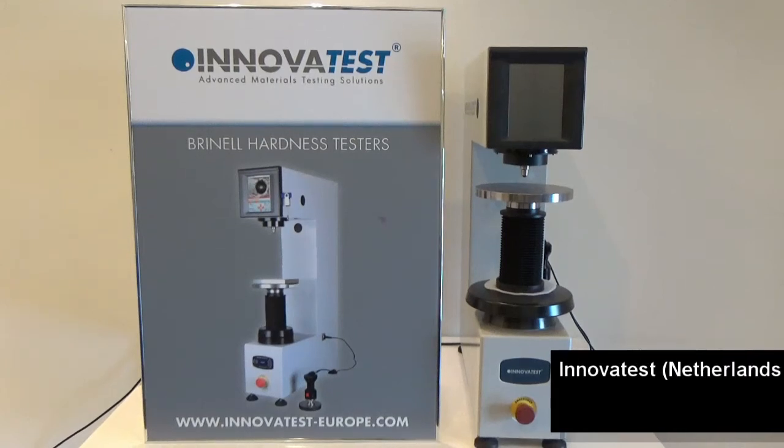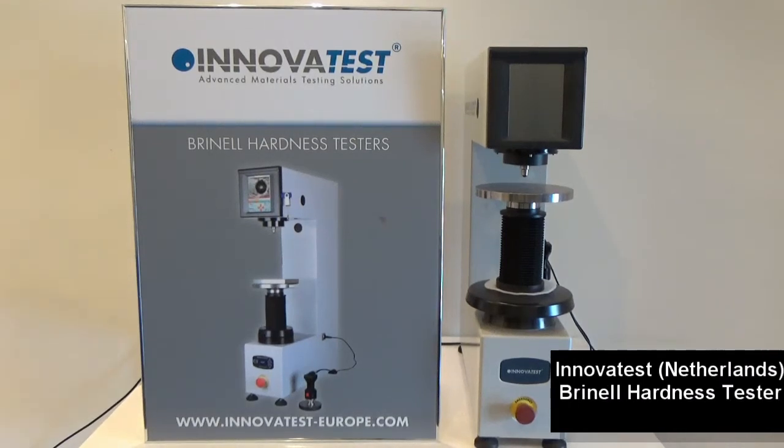Hi everyone, today we have this Brinell Hardness Tester from Innova Test with the model number Nexus 3200.